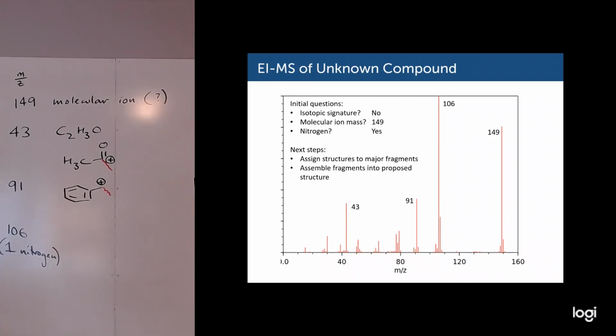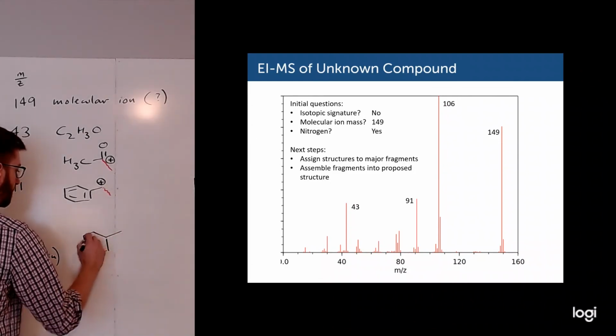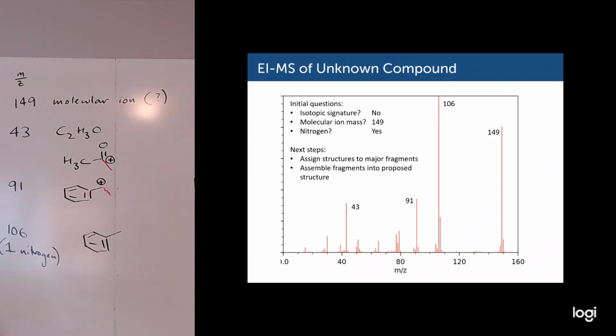ChemDraw is great for this because you can draw the structure and then actually use the analysis tool to very quickly calculate molecular weights. Just make sure you put that positive charge in correctly, because otherwise you'll end up being one off, and that's from having an applied hydrogen where there shouldn't be one. And that's actually how I would normally do this if I weren't trying to make a video or whatever. So instead I'm going to think about, well, 91 gets me to here. And then I need to think about finding an additional 15 AMU.